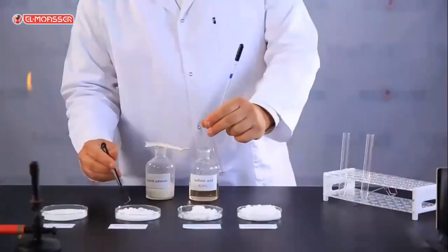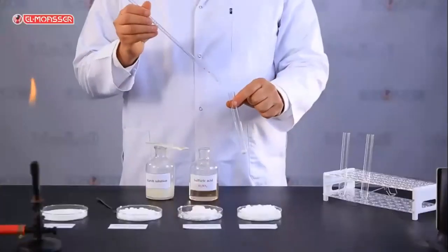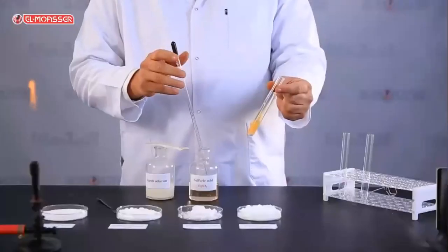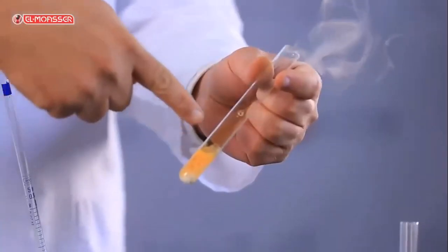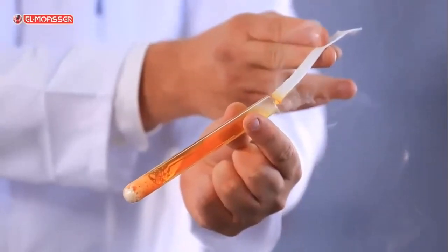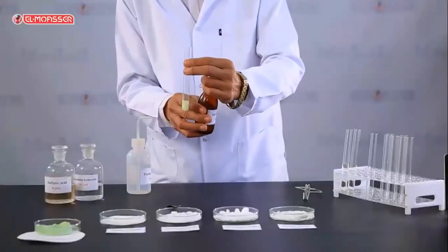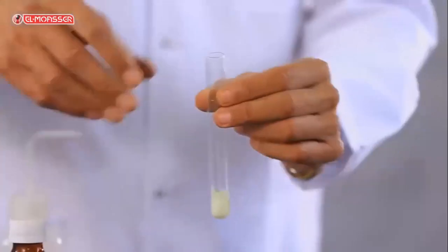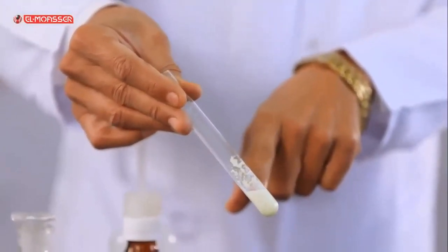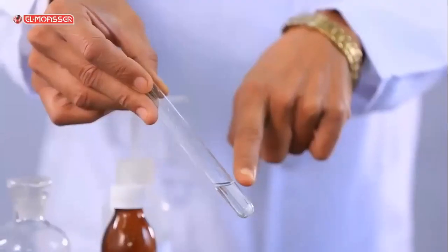Summary. On adding the concentrated sulfuric acid to sodium bromide salt, reddish-orange fumes of bromine are separated and change a paper wetted with starch into yellow. On adding silver nitrate solution to sodium bromide solution, a white yellowish precipitate of silver bromide is formed, which slowly dissolves in a concentrated ammonia solution.